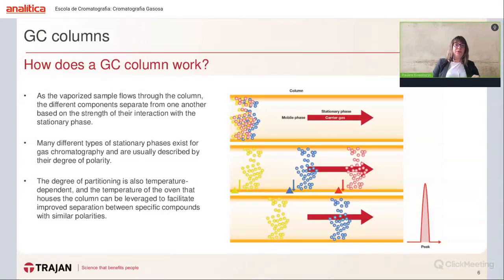At the top, you've got an image where our sample, our mixture, is in one place, and then with the gas flow, our components are getting separated from each other, as each component has different properties, different weight, so will travel through the column at different speed.